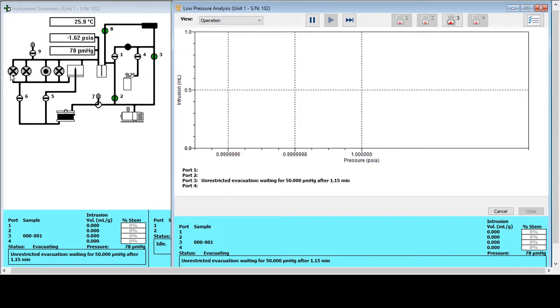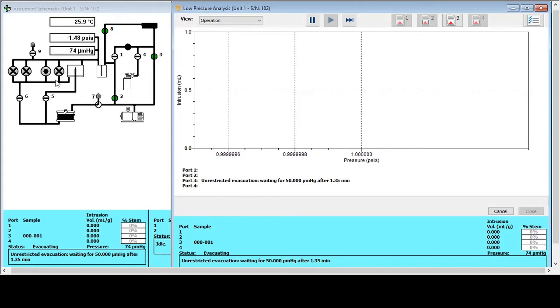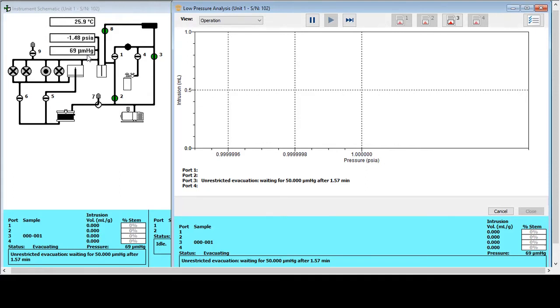The other ports haven't got any penetrometers in there. Now at the moment, the sample is evacuating. The entire low pressure system and the penetrometer, including the sample, has been evacuated, and it's been evacuated through this pump down here. At the moment, the system is at 71 microns mercury pressure. And this process is going to continue right up until a set point is reached. The set point is normally 50 microns mercury.